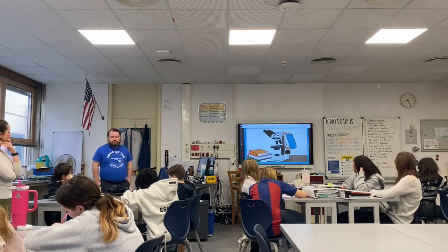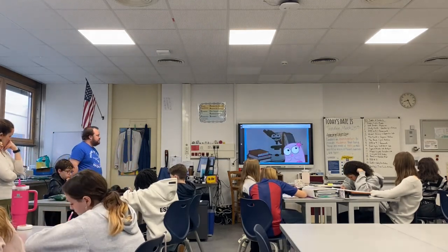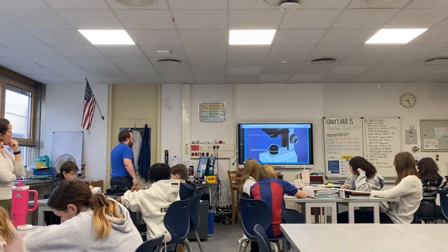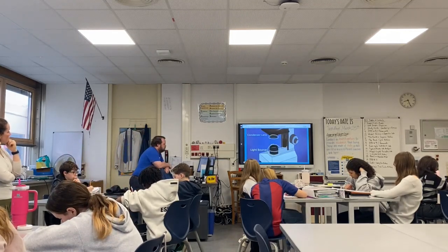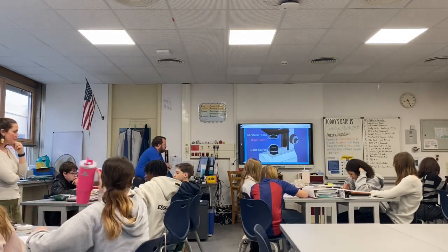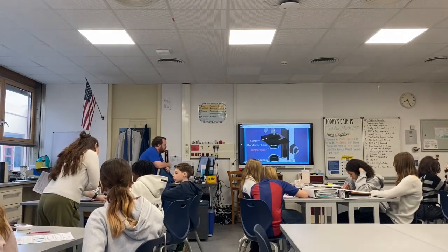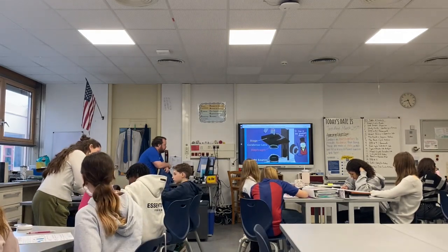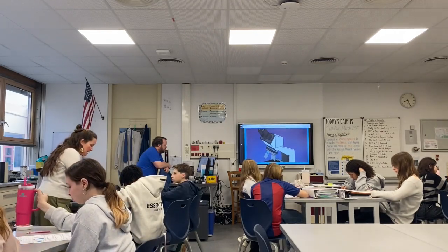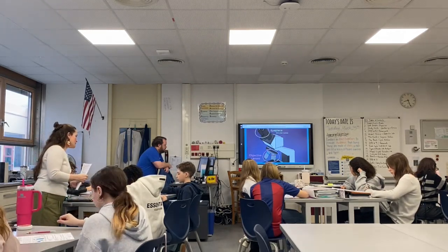Let's come back to the typical microscope you might see in a classroom, which happens to be the one that I own, a bright field light microscope. Here's our light source. Light passes through this, the condenser lens, to focus the light on the specimen. The level of light can be adjusted by the diaphragm. Our specimen, likely to be on a microscope slide, will be placed on the stage here. Light will be reflected, diffracted, or absorbed by the specimen. But we rely on these lenses here, the objective lens and the eyepiece lens, to get our total magnification.